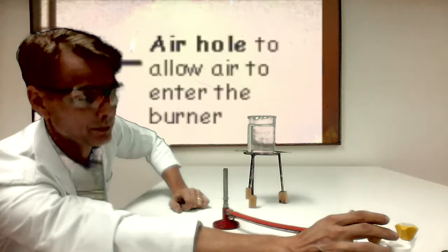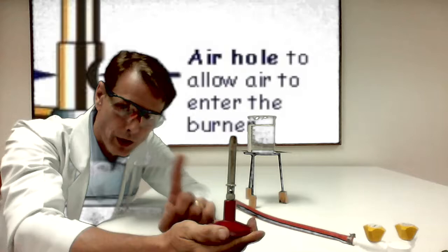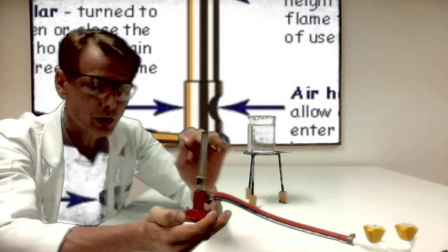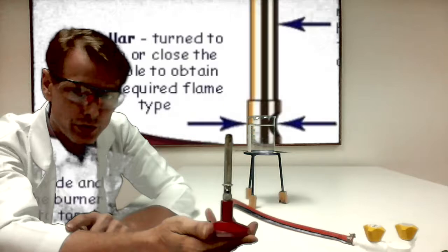When lighting a Bunsen burner, what you should do is observe. There is something called an air hole, an inlet right here. Can you see that hole? This allows air, oxygen, to mix with the gas coming through this pipe and thoroughly burn as a result of oxygen being combined in a proper proportion to burn all of the carbon-based fuel that we have coming through this tube. What you should do to light a Bunsen burner, though, is to close this inlet hole.